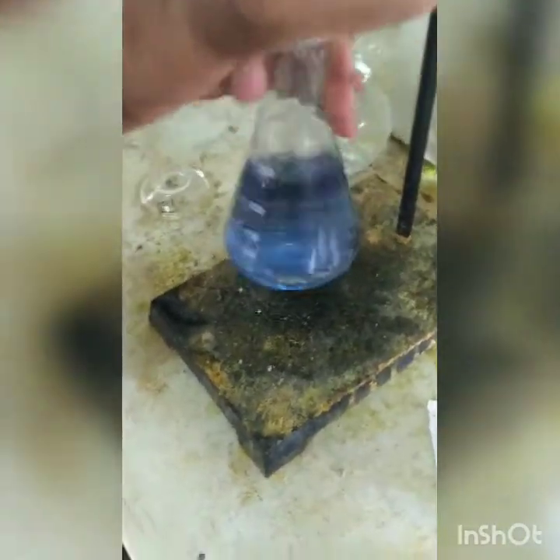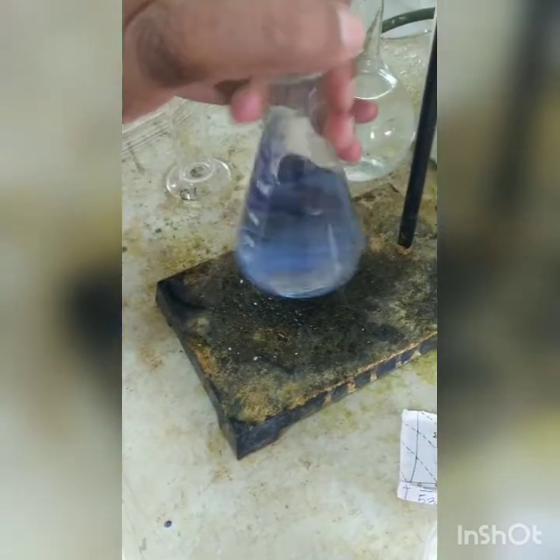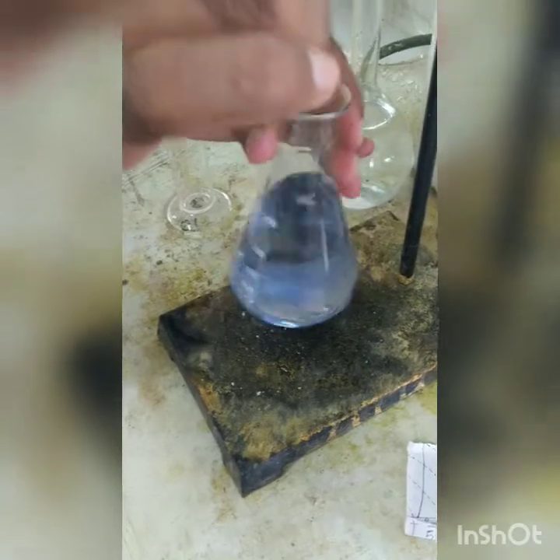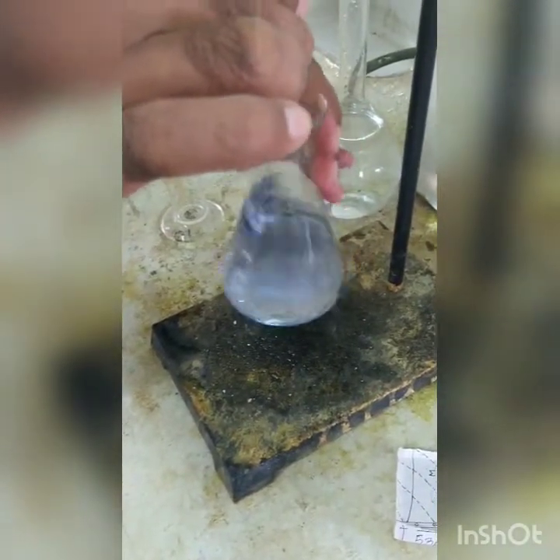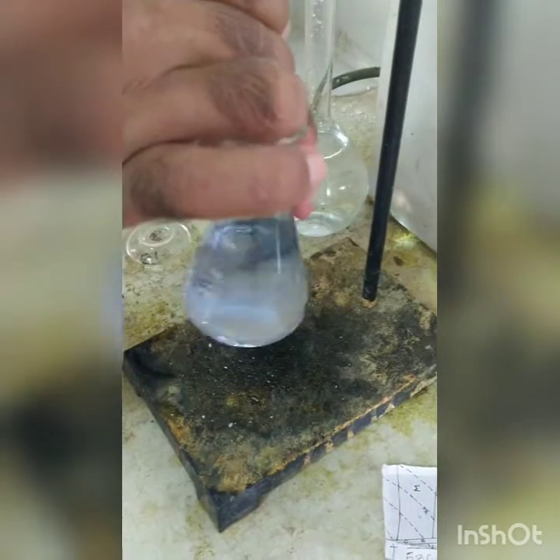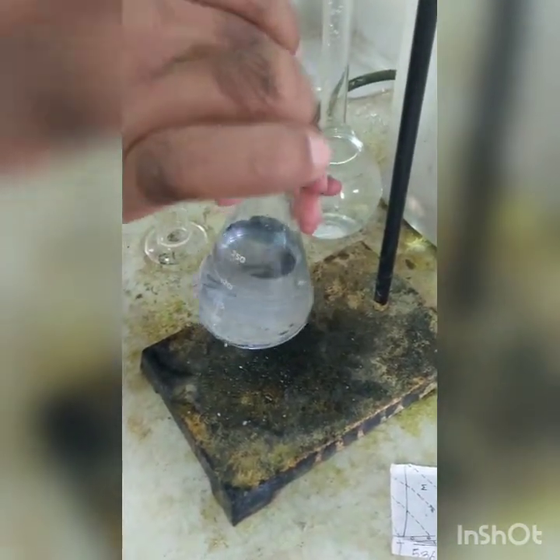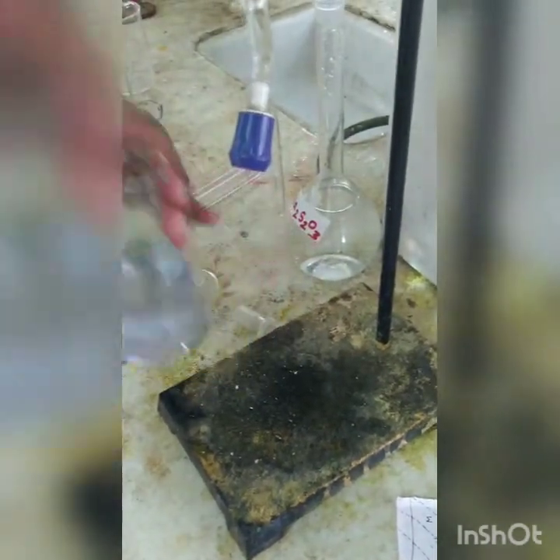You can see the intensity of blue color is diminishing, reducing, and our end point is the first disappearance of blue color. You can see some bluish tinge is there. Yes, now the blue color has disappeared. The reading is 10.5 ml.